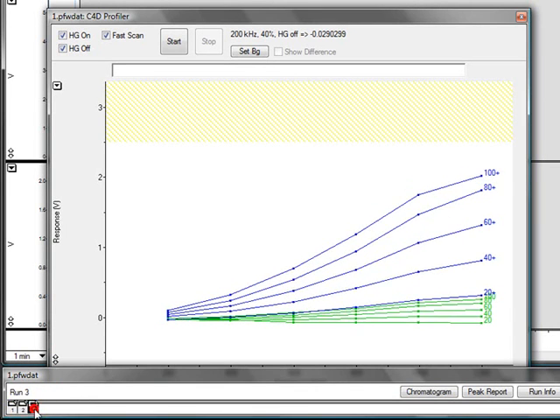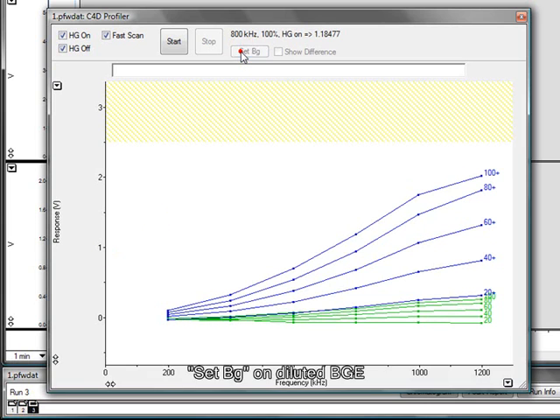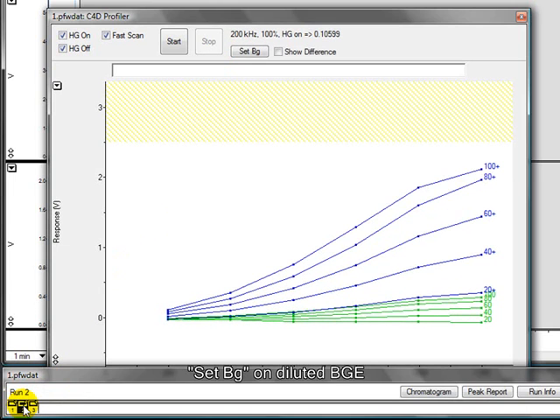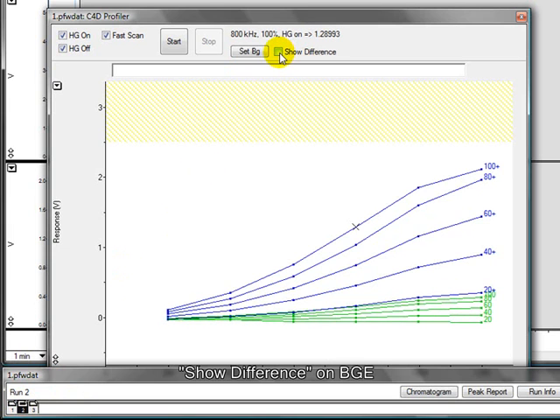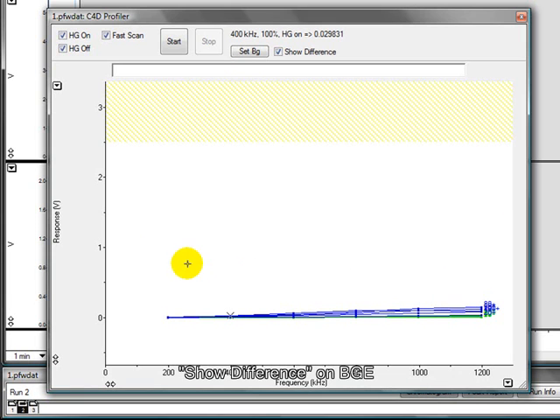What you want to do is click the diluted background electrolyte and set this as the background. You then choose your undiluted background electrolyte and you want to see the difference. What this has done is subtracted the diluted background electrolyte from the undiluted background electrolyte and shown the difference.